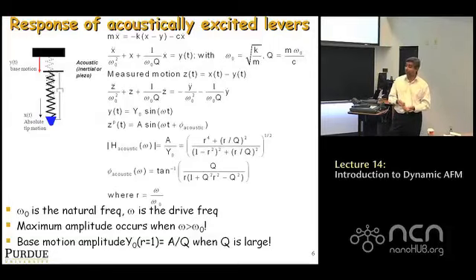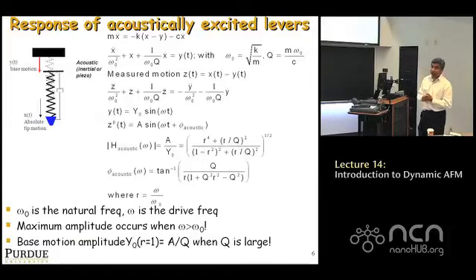When you do acoustic excitation or base excitation, which 99% of you use, or will use if you haven't used an AFM, that's what you're doing, okay? It's a very subtle point, and many people don't get it. But that's what you measure, all right? And when you do tuning curves in an AFM, all you're measuring is this relative bending between the base of the cantilever and the tip. It's a very important thing.